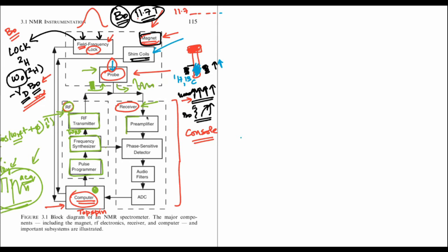One of the main components here is called a pre-amplifier. We will learn about the pre-amplifier again in a little while. The main difference between the pulse and the signal that you obtain is that the pulse is of very high power. However, the signal that you get is of very low power. In terms of current, you can think of measuring signal currents in milliamps, and the pulse current in amps.